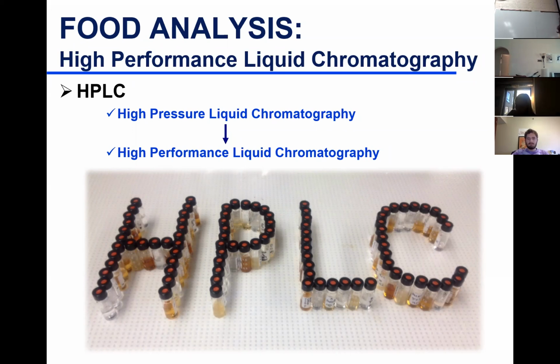This is basically the different beverages that you would prepare in the lab, where you dilute and then run them. One of our former TAs did that, and I thought that was a really nice illustration.